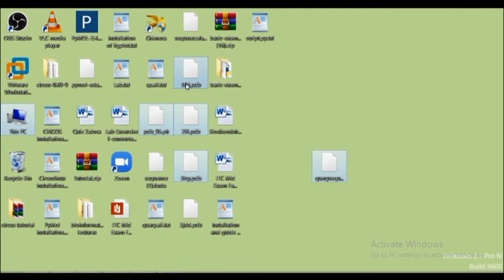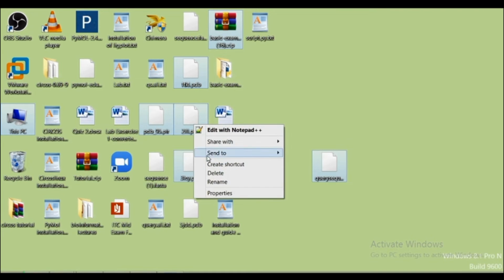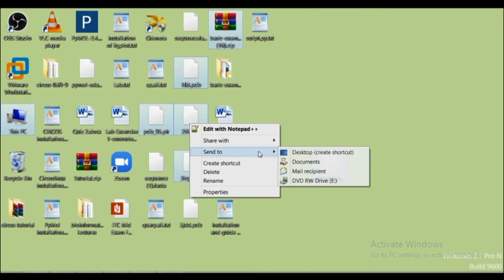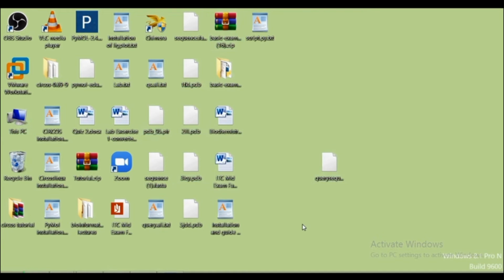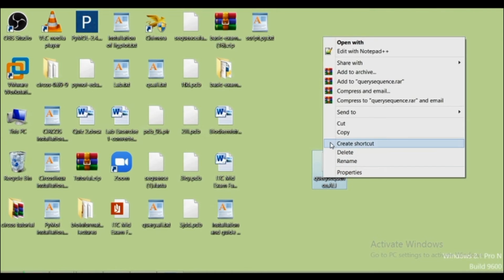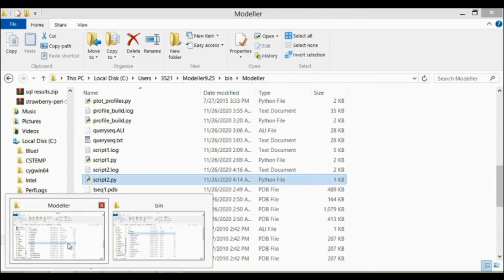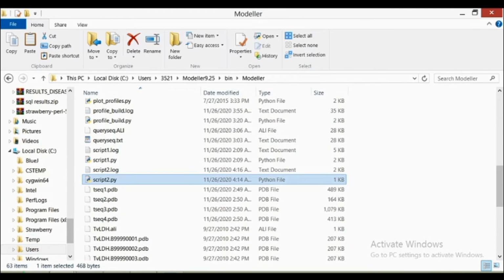and the 4 structure files and the pdb_95.pir file which I downloaded while I was downloading the homology modeler. So I'll just copy those files. It's not showing copy. Why is it not showing copy? Just now, okay. So I'll just copy those, this one and that one separately.